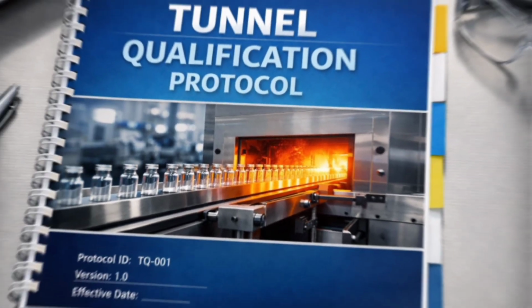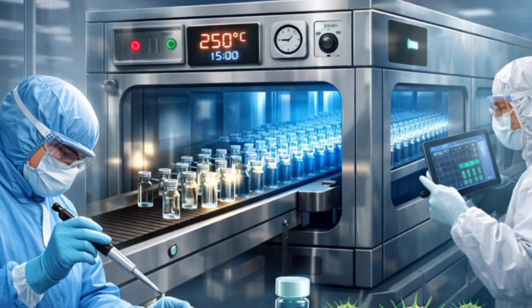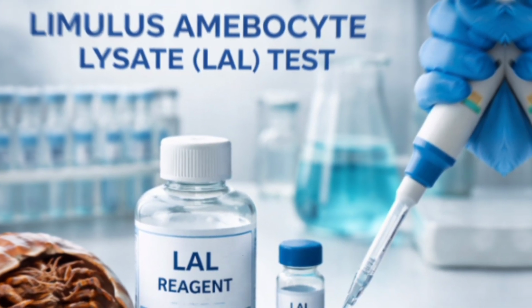How is an endotoxin challenge study performed? In simple terms, a known concentration of endotoxin is spiked onto the vial and passed through the depyrogenation tunnel. After completion of the processing, the endotoxin level of exposed vials is measured with the Limulus amebocyte lysate test. If the reduction of endotoxin level meets the required log reduction, the challenge study is considered passed. So this is a simple explanation about the endotoxin challenge study. Now let us see the procedure of the endotoxin challenge study.